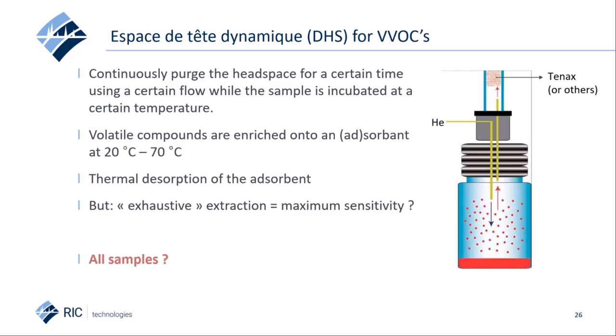Again, we focus on the analysis of water samples and for very volatile and more difficult hydrophilic compounds. The volatiles are trapped first onto an adsorbent tube kept at around room temperature during dynamic enrichment. Afterwards, this first high-capacity adsorbent trap is thermally desorbed and compounds are refocused into a PTV injector before they are injected towards the column by heating up this injector.